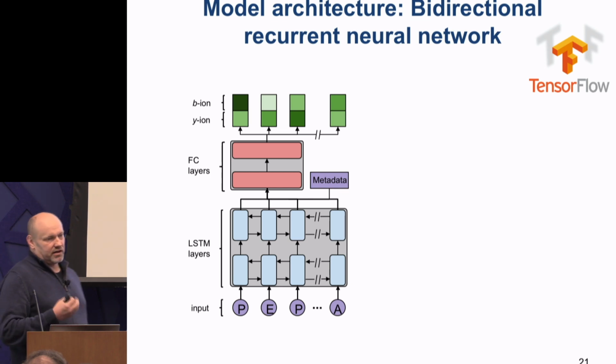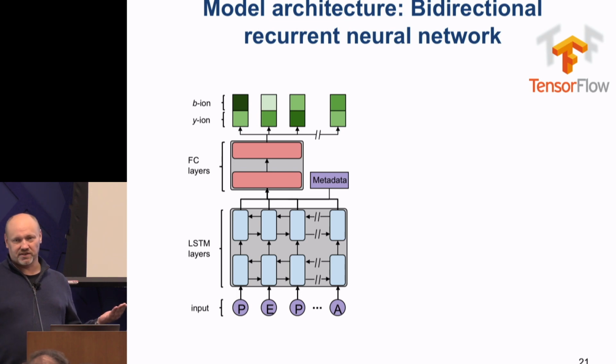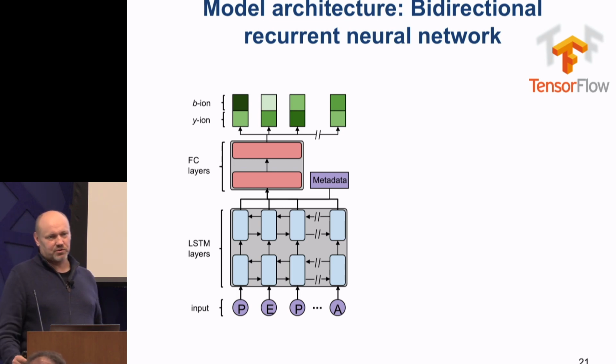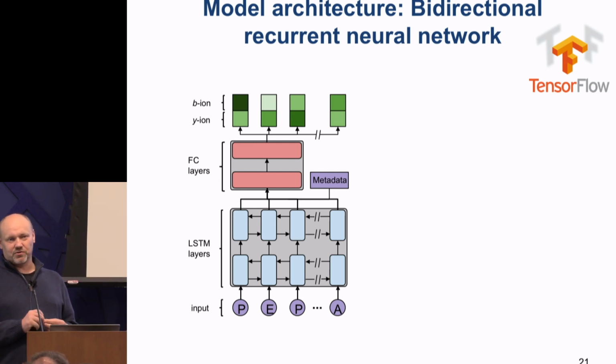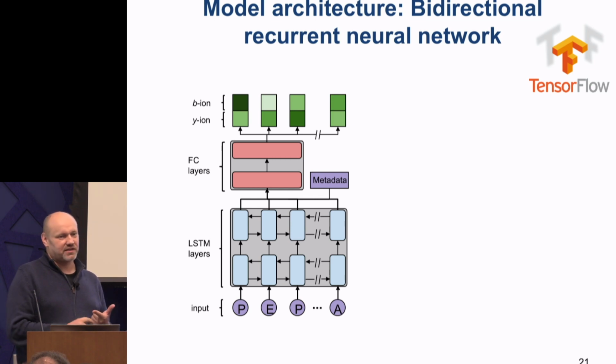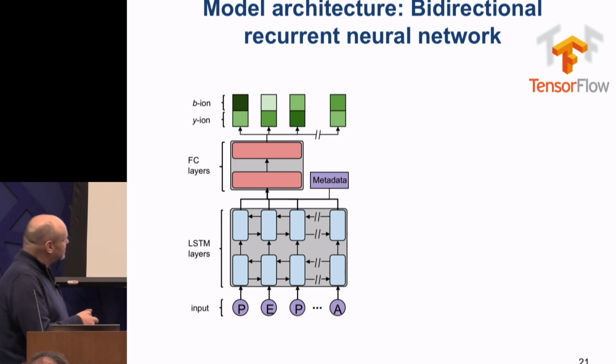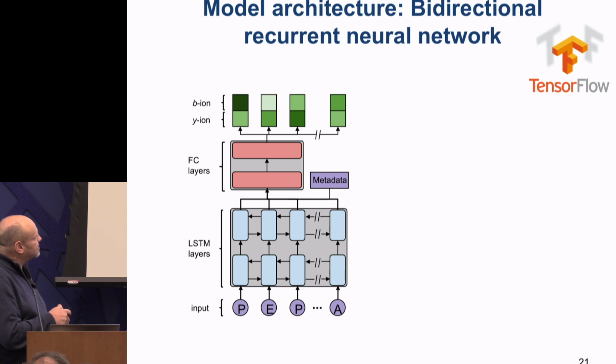In natural language processing every word has a different length, so something that works with a fixed length representation, like linear regression, is not useful there, and also not for analyzing peptides, because peptides also come in different lengths. So it has an input of variable length, and what comes out is a fixed length representation that is much easier to handle.